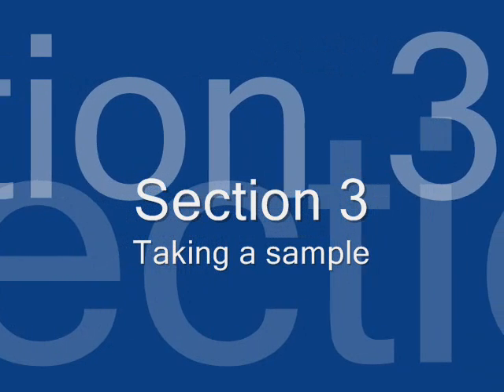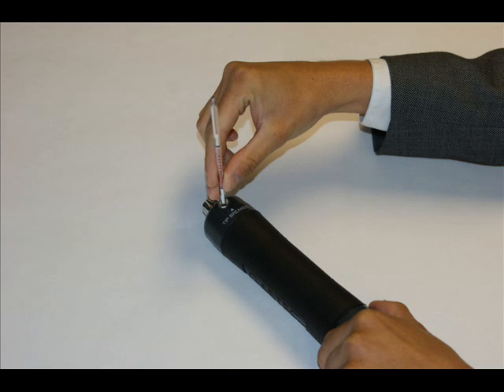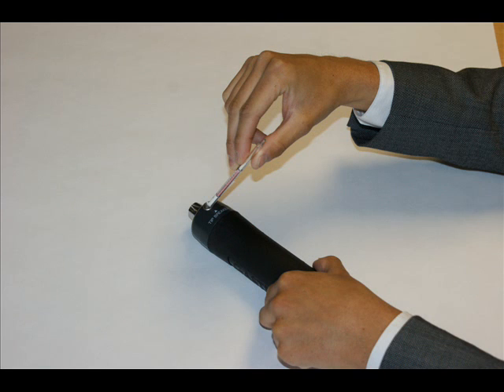Section 3: Taking a Sample. Select the correct tubes for the gas which you wish to detect. Remove from the packet and insert the tube into the tip breaker. Rotate the tube within the tip breaker scoring the edge of the tube, then tilt to one side to break off the end.